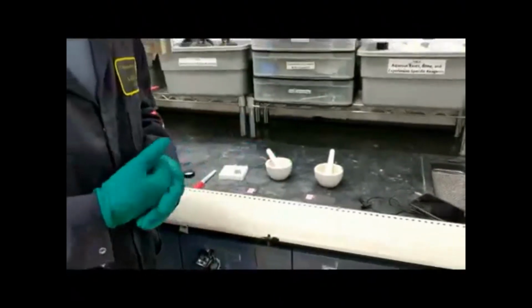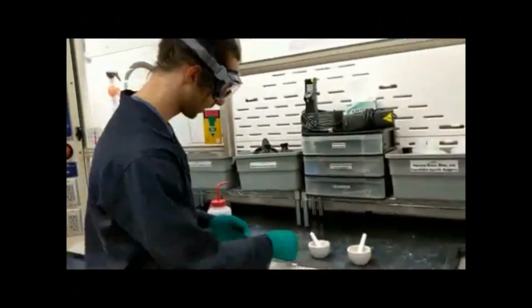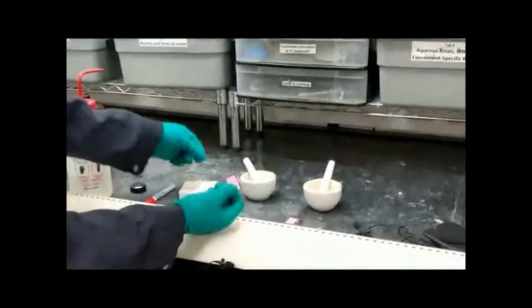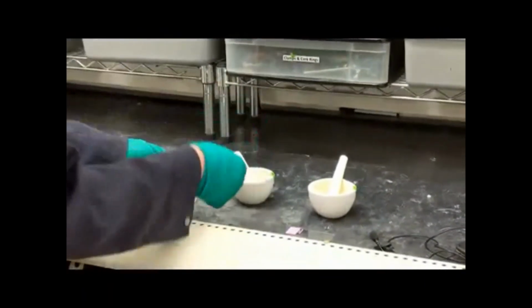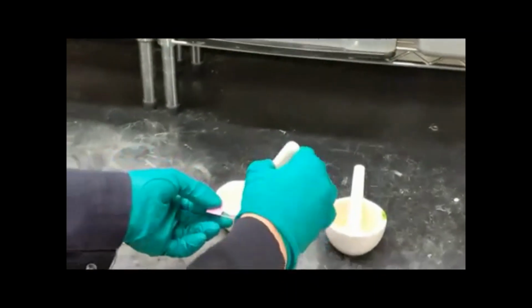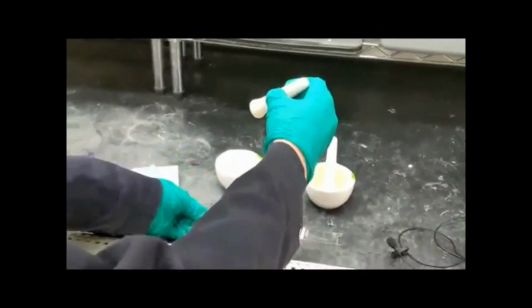At this point, we need to prepare our slides in order to analyze the effect of polarized light on these samples. In order to do that, we'll be using these little slides as well as these cover slips in order to prepare a sample. The simplest way to do this is to simply take your mortar and pestle and get a little bit of liquid on the bottom of the pestle, and then simply dab that onto the slide as such.